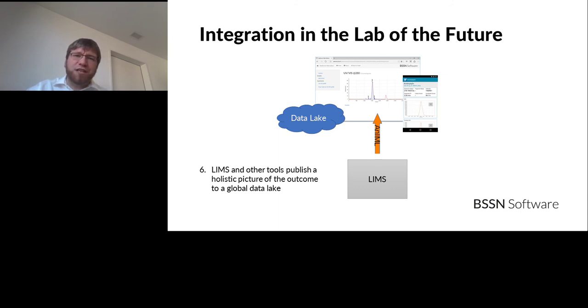And this is a very cheap side effect that I get from setting up my system integration that way. I get full traceability, and I can repurpose the data packages that I generate here for many different other purposes. And this is already being done today. So we're not just talking about some future vision, but everything here is actually working. And I want to show you what that looks like in practice.